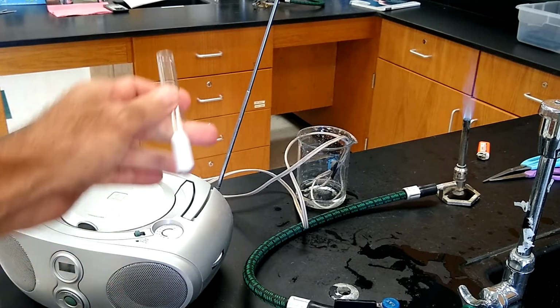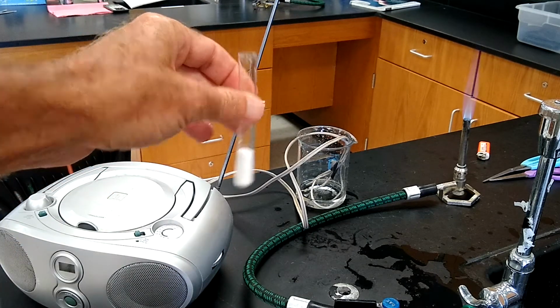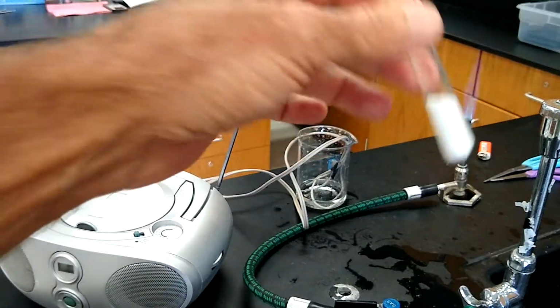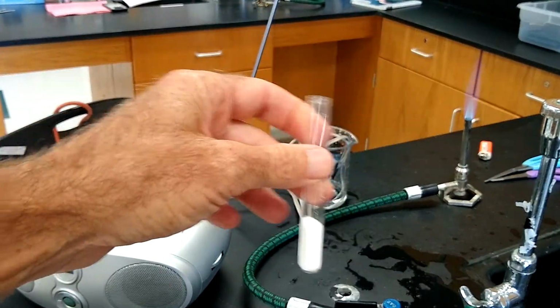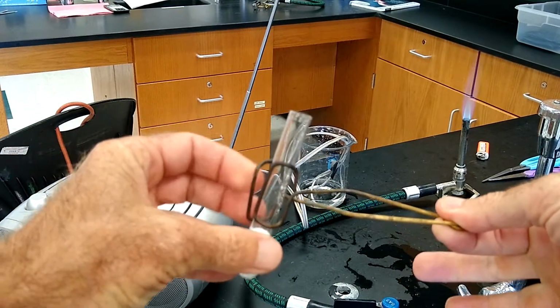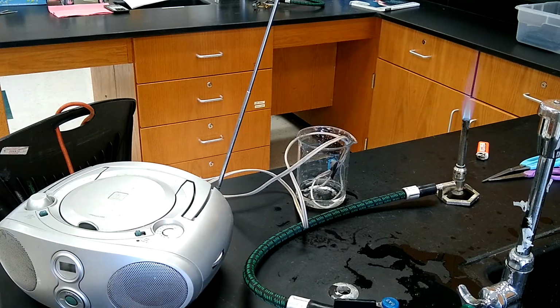All right, people, we're going to have a little quizercise on ionic and covalently bonded substances. Right here we have a mystery white powder. You don't know what it is, so I'm going to put it in my test tube holder. I'm going to hold my test tube holder over here, and I'm going to ask you some questions about it. Here we go.